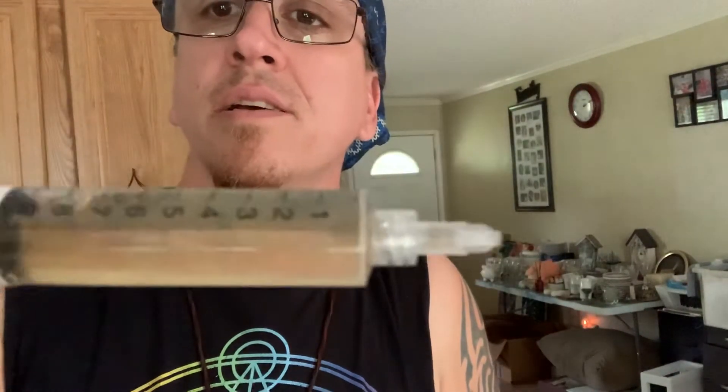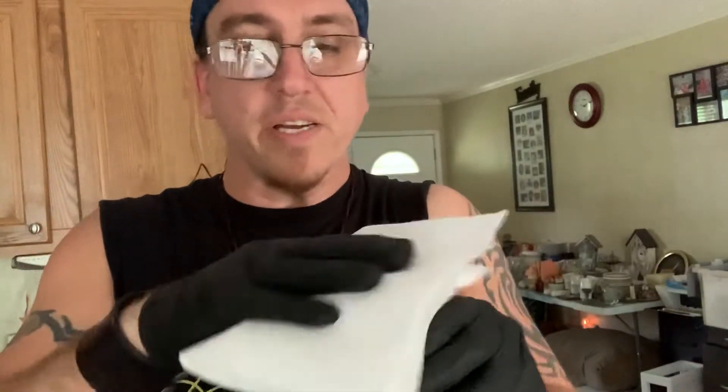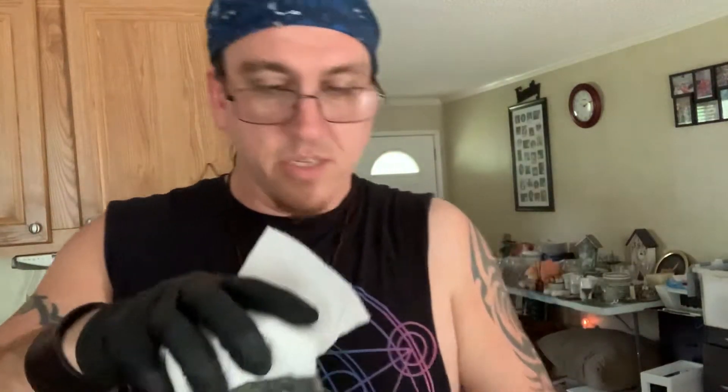After you shake it up real good — you can see all the cloudiness in there, that's the spores, you may even see black specks — I take a napkin, spray it down with alcohol, and wipe down the top of the jar real good. You want to get all that bacteria off the top so there's no chance of injecting something bad inside of your grain jar.